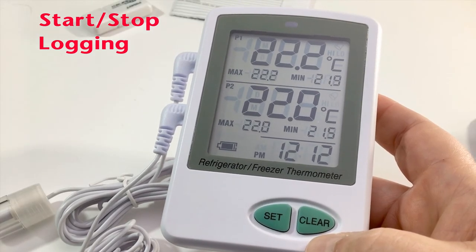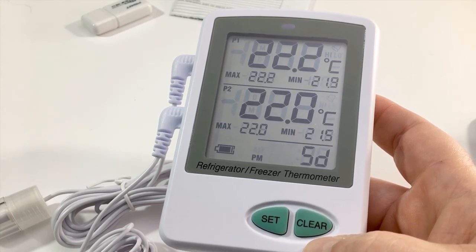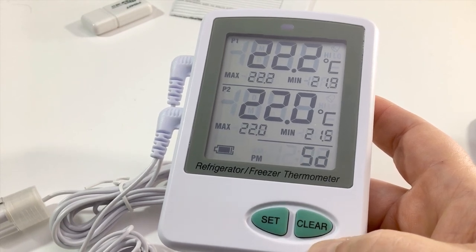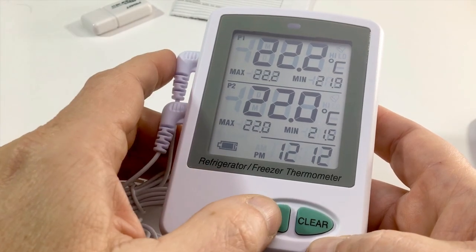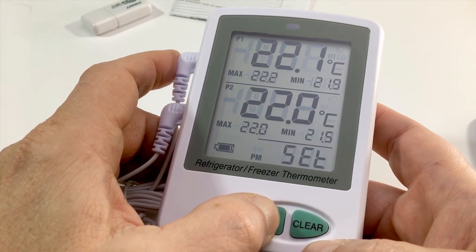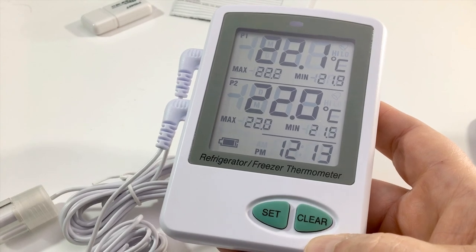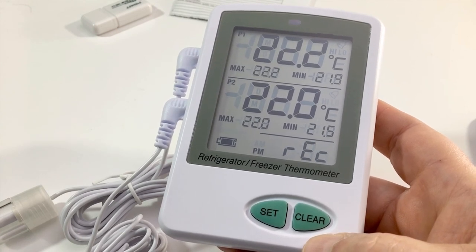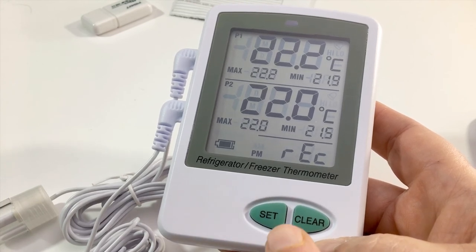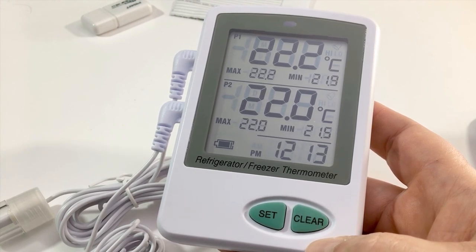Now that the unit is completely configured with date, time, min/max alarm settings, and the temperature probes have stabilized, you are ready to start recording data to the SD card. To start recording, press and hold the Set button for approximately six seconds until 'ON RECORD' shows on the screen, then release. You are now recording to the SD card at the logging interval set earlier. You can confirm recording by watching the lower right corner — it toggles between the time and the word REC.